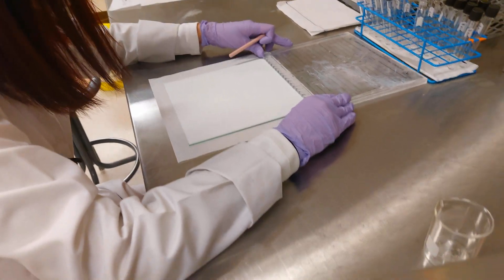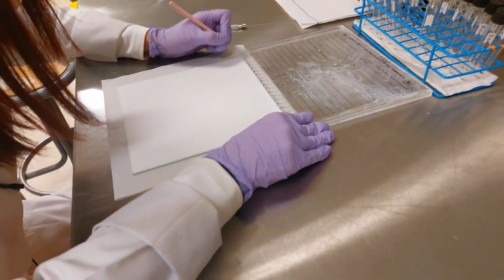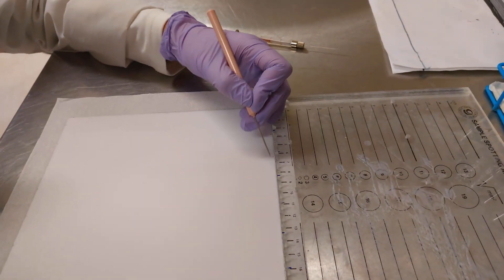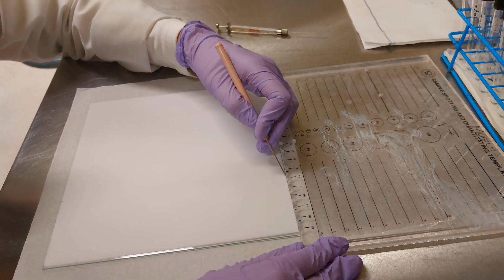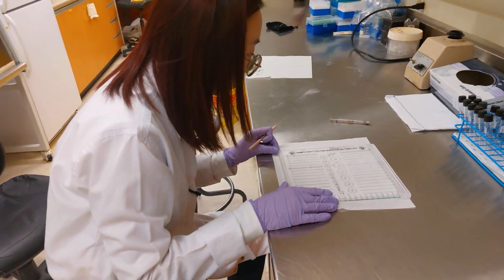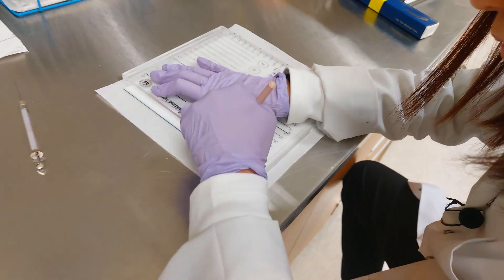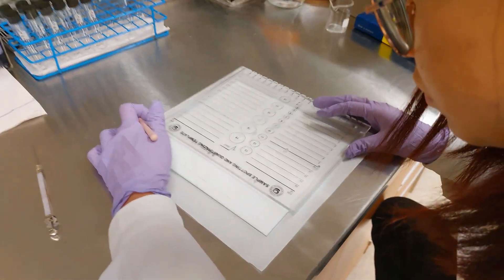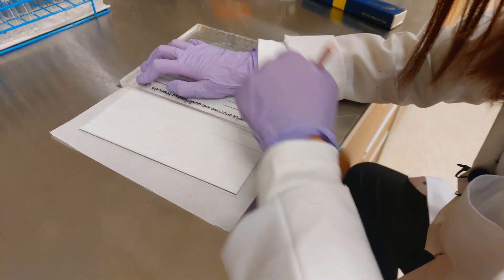Once she's done with the bottom, she needs to mark the top of the plate so you can draw a line across. I'm going to zoom in a little bit so you can see exactly what she's doing — just marking all the different sections. Once you're done putting a line at the top and bottom, the next thing is to just draw a connecting line from top to bottom.